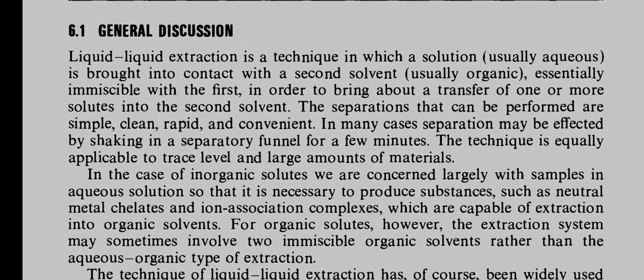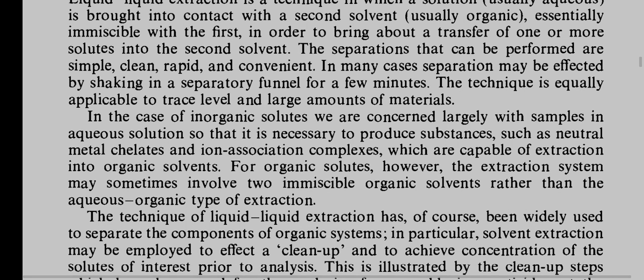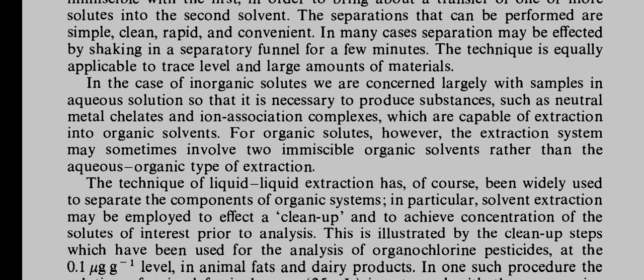In many cases, separation may be effected by shaking in a separatory funnel for a few minutes. The technique is equally applicable to trace levels and large amounts of materials. In the case of inorganic solutes, we are concerned largely with samples in aqueous solution, so it is necessary to produce substances such as neutral metal chelates and ion-association complexes which are capable of extraction into organic solvents.